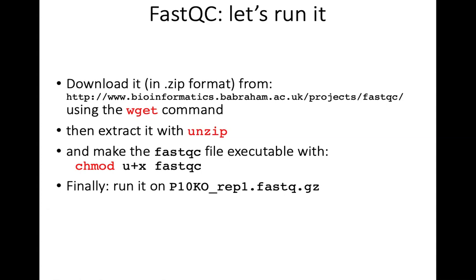It tells you the file does not exist. So that's why you always want to use documentation, because basically the file is not where you think it is, right? This is where you are. So you are not in the right directory. You have to get the exact address of where the file is, otherwise Linux cannot find it.